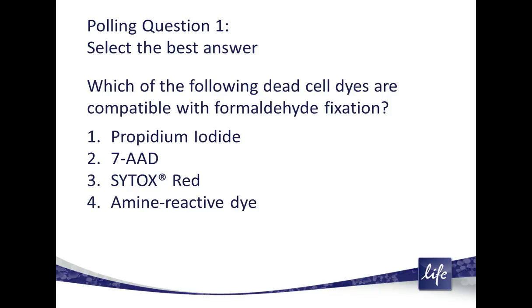The LIVE/DEAD fixable or amine reactive dyes do maintain the distinction of live and dead cells. While choices 1 to 3 are all impermeant nucleic acid dyes, these are not as compatible with fixation.